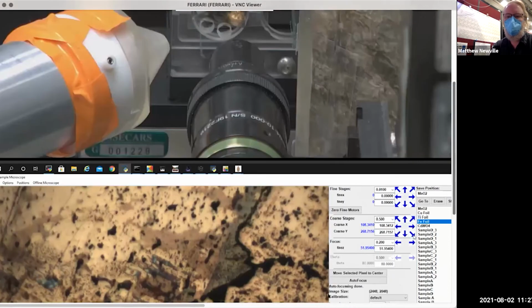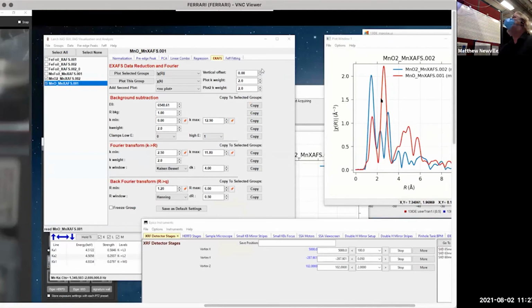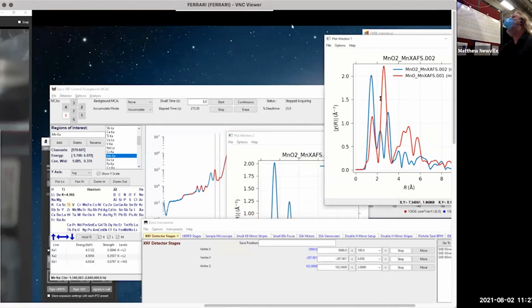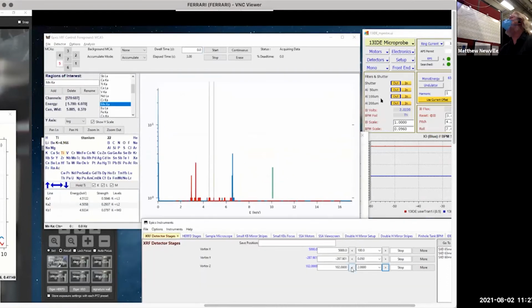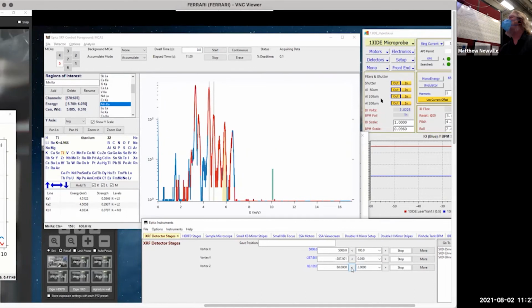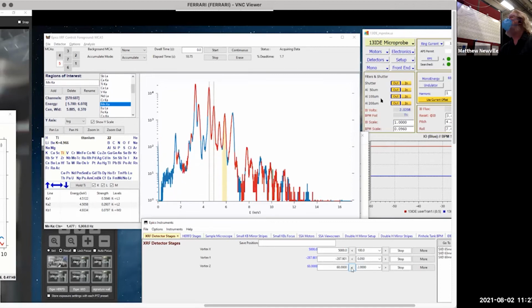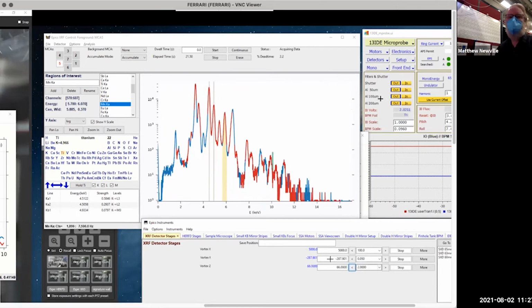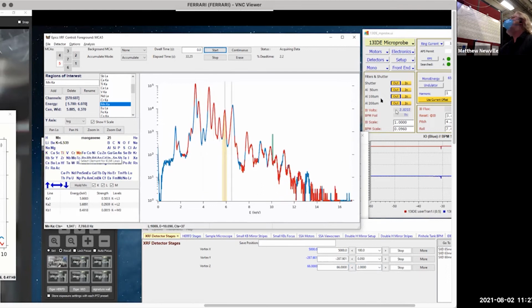And then let's go to the fluorescence detector, which was up here. Okay, I'm going to use this one. I got to move the detector back in. Okay, I'm going to leave it there. So this is the fluorescence spectra we're seeing on this sample. We see a lot of potassium, potentially interesting, titanium, chromium, and some manganese. I'm going to move the energy up, actually, I think you can see this now over here at 6600.